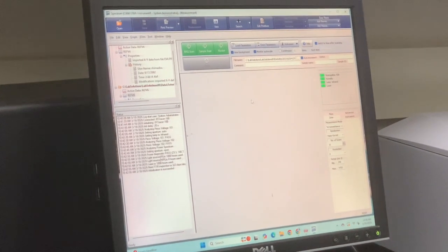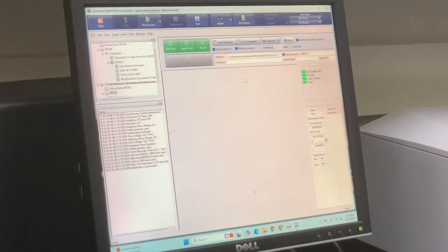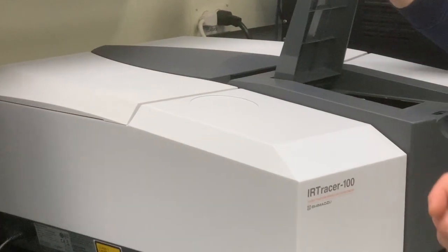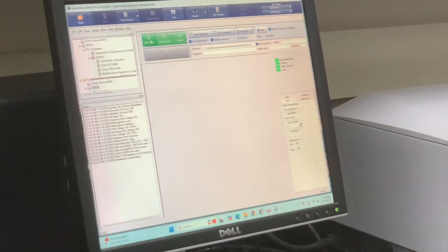So, did you have... It's send as a send. Is it already? Yes, okay. So let's, here, sorry, you take it out. Let's run a background check first. Or not the check, just run a background scan.